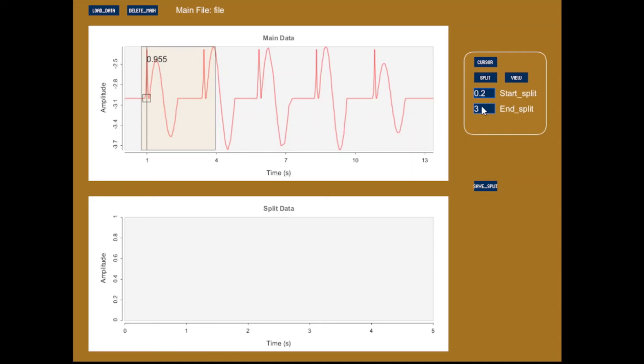The right side of the box is three seconds over on this side of the cursor, and we want that to just encompass one data set. So let's change that number there. We're going to click in there, backspace a couple of times, and make this 1.5 seconds. In order to update that, we need to hit the cursor button. And now you can see we have our data inside the yellow box. When we hit the split button, that transfers that data down to the split data window.